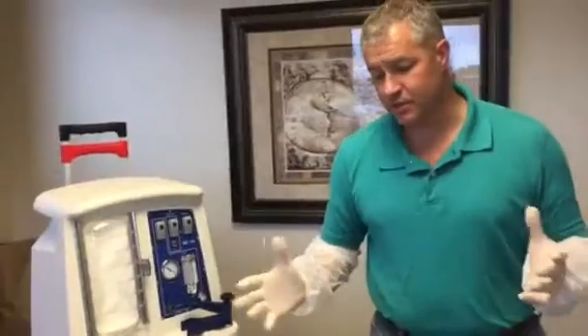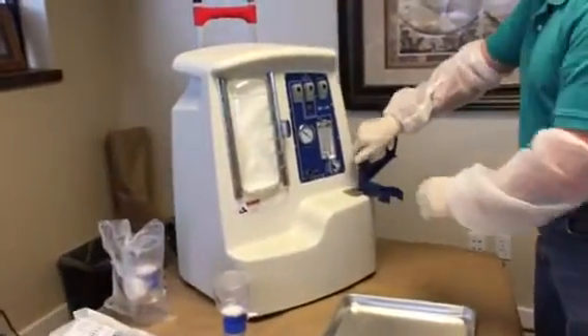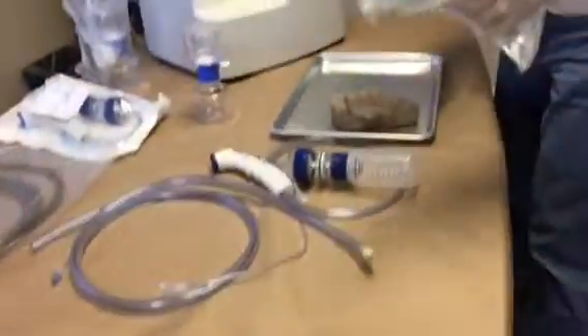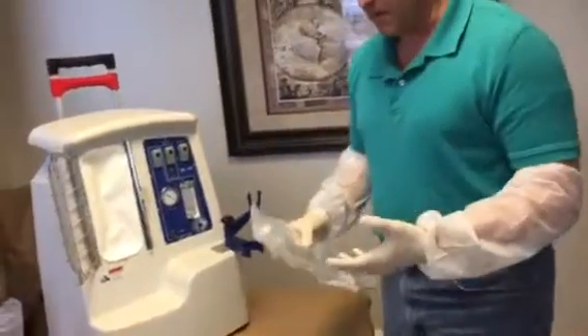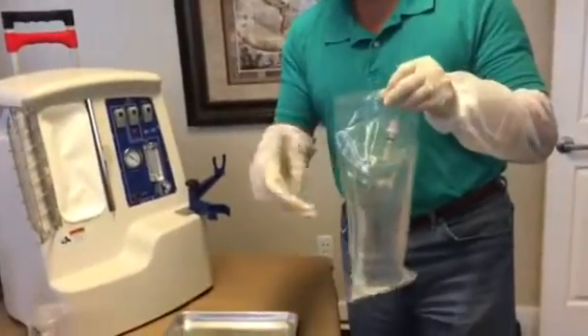So putting these together is really simple. The first thing we do is we want to prep the SEC here, open this solution door up. Now all of the items come in this special over-wrapping like this, but I'm just going to open one of the solutions because I don't want to waste good stuff.